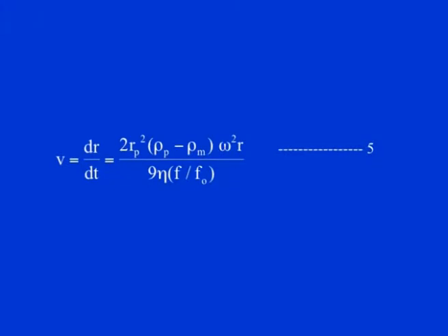So, the frictional coefficient of these molecules has to be compared with the frictional coefficient of a similar sphere, and so the equation will be different from the previous equation we saw for the ideal, unhydrated spherical molecule. The result is that the particle will sediment at a lower rate, and the equation becomes this one, where you have to add another factor, that is the frictional coefficient of the elongated or non-spherical molecule compared to that of a sphere.